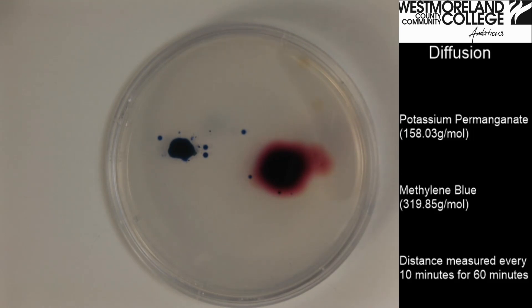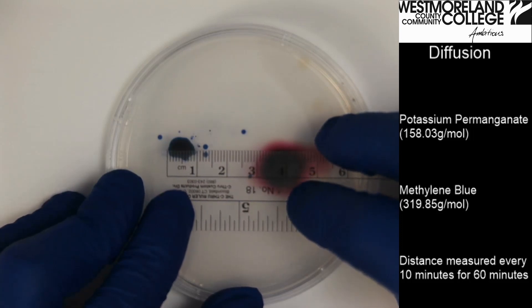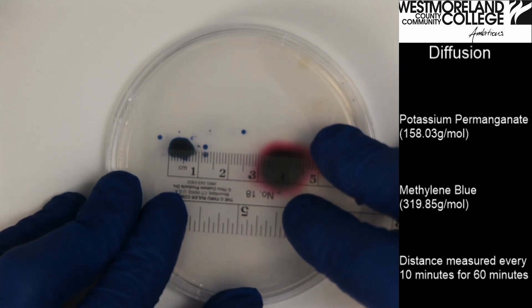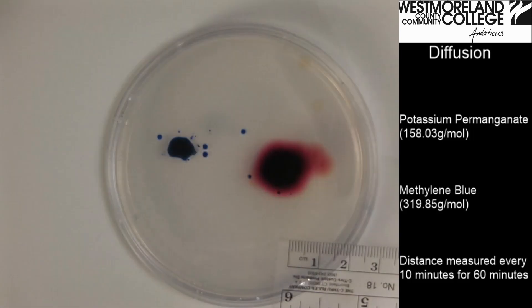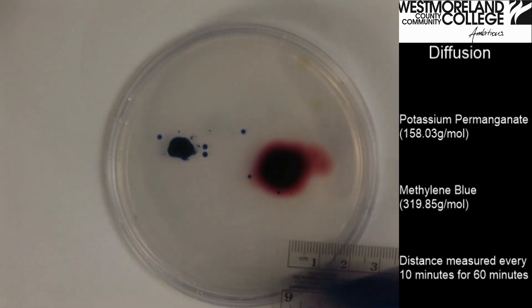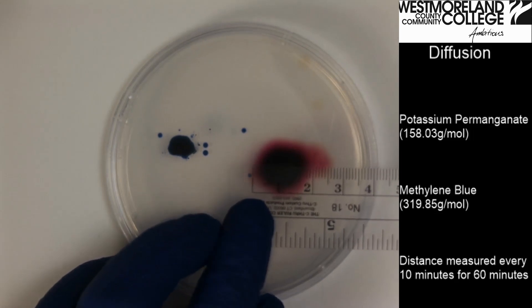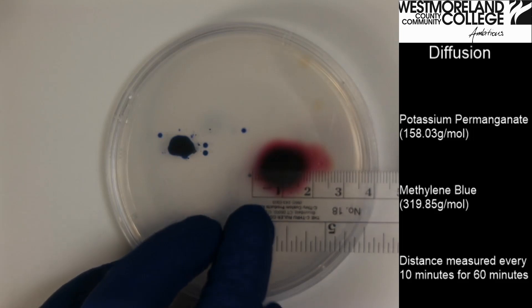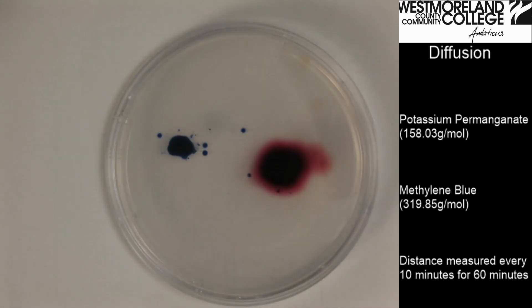It has been ten more minutes for a total of thirty minutes, and I will take another measurement. The methylene blue is at ten millimeters, and the potassium permanganate is at approximately twenty millimeters. We have thirty more minutes of measurements to take.